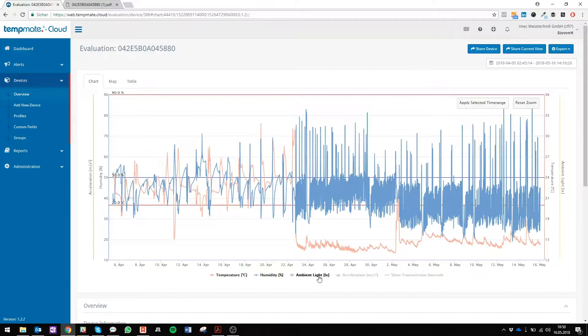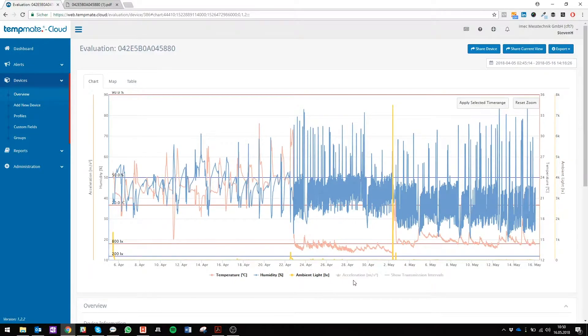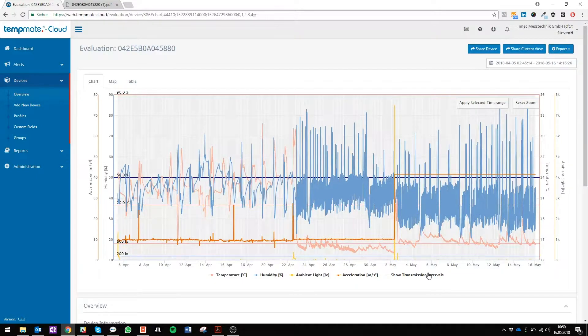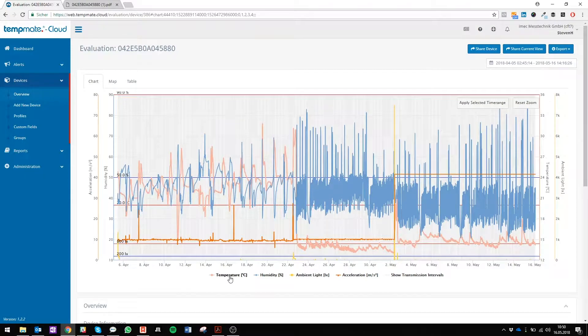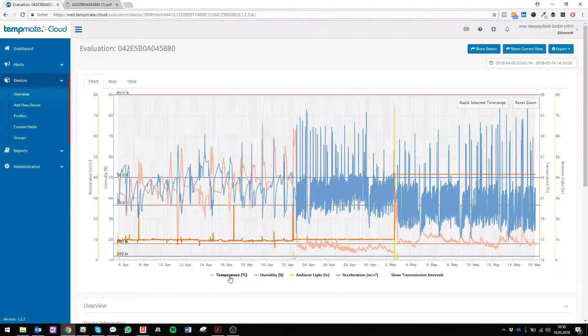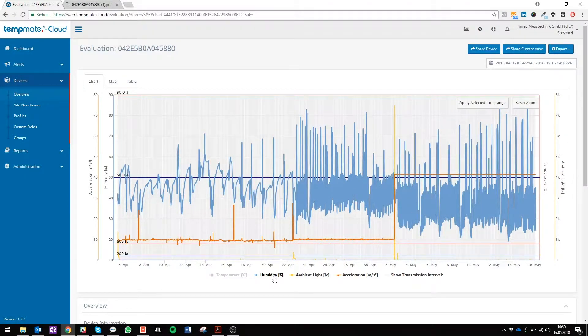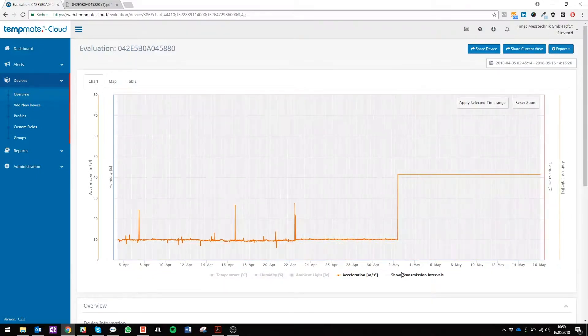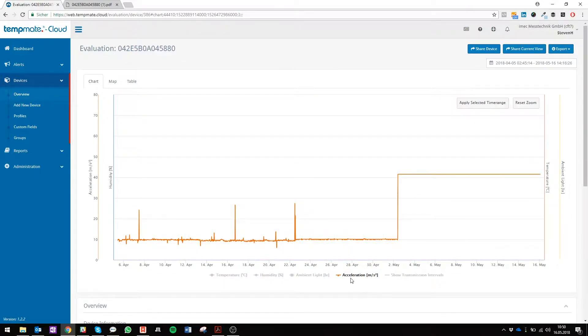Then ambient light, that's yellow, acceleration and transmission intervals. So if you want to see just one parameter, just deactivate the others. Now you can see just the acceleration.